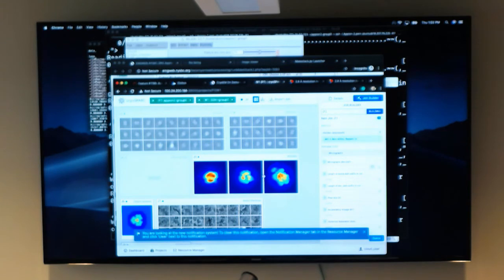It's topped out. Don't know, did we change the parameters or use the same parameters? No, you changed to C123. That's it. Which one?